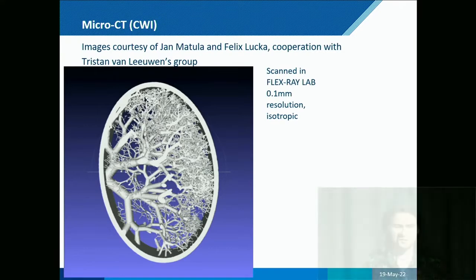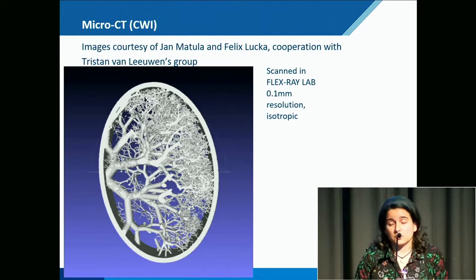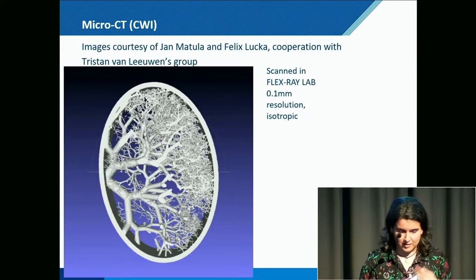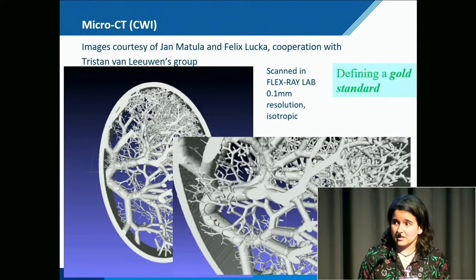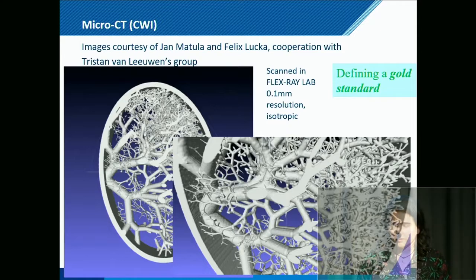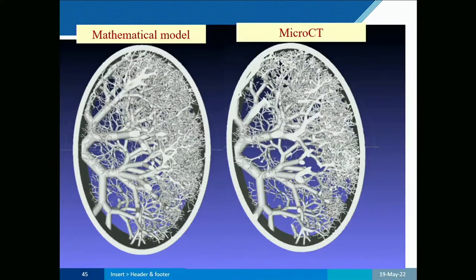And we weren't too ambitious in terms of the resolution that we went for at first, because it was a pilot. So we went even only for 0.1 millimeters in resolution, but that is even below the smaller sizes that we have in the phantom. And here you can see what the micro-CT looks like. If you remember a bit what the model looked like, it's a very nice resemblance. So the micro-CT we can actually use to define our gold standard for the object that we have produced.